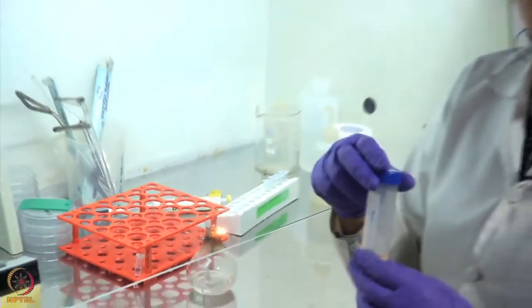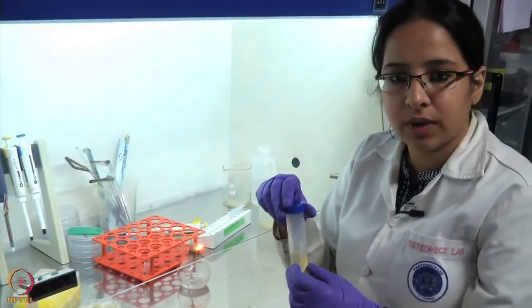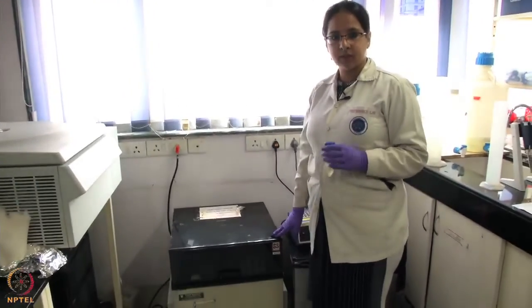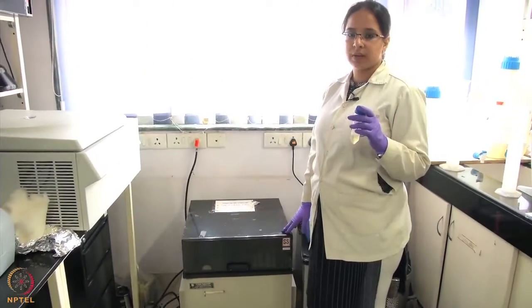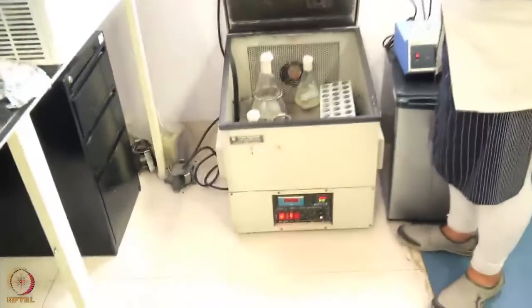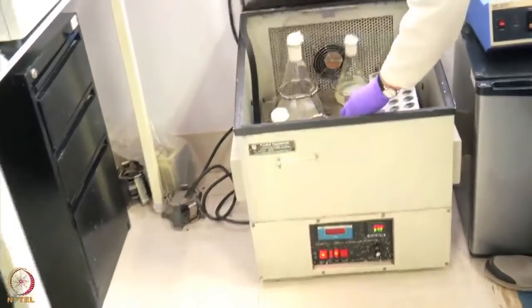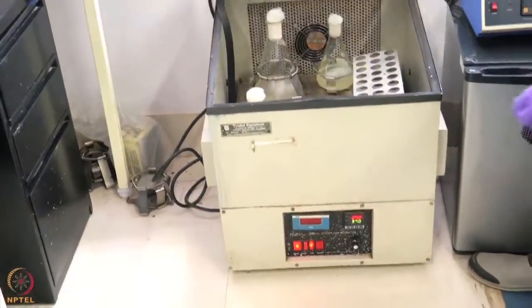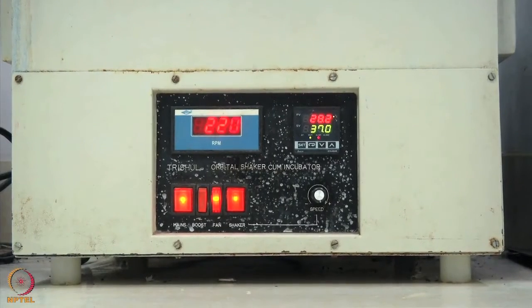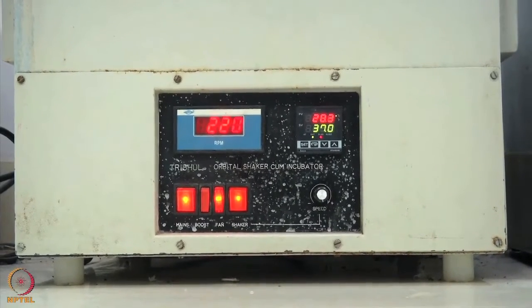This again we will incubate at 37 for overnight, almost 16 hours. So this is the shaking incubator in which I will keep this tube for overnight incubation. You can see the temperature set is 37, which is ideal for bacterial growth.